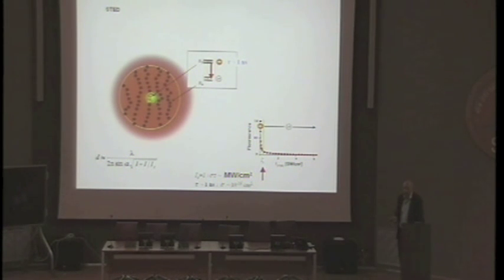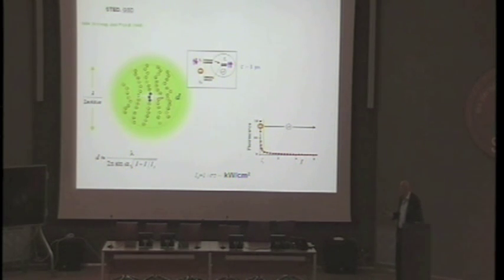Now, once you realize that, and I realized that very early on, then you know, oh, this is about on-off for two states. It's not critically stimulated emission. Stimulated emission is just one method of doing it. So there must be other pairs of states in the molecules. If you look at molecules that have many states, they could do the same job. One option, and those who have a chemistry background know about that, is that there are also dark states, so-called triplet states or other dark states. And of course, you can push a molecule to some extent also to those dark states in various ways.